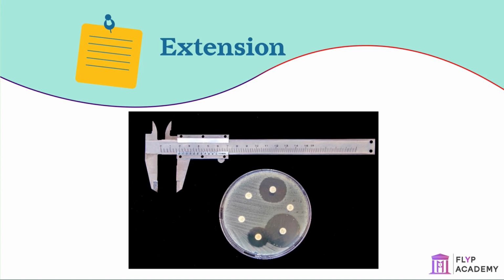The diameter of the clear areas could be measured with a ruler and the radius and then the area calculated. Other factors that may need to be taken into consideration would be cost and suitability of the cleaner for a kitchen. For example, if it is poisonous or bad smelling. If the cleaner was poisonous to humans, it would not be suitable to be used around food. If it was bad smelling, it would not be ideal to use in a restaurant.